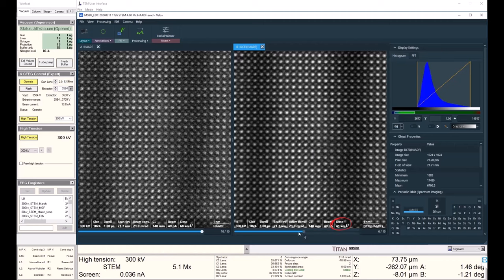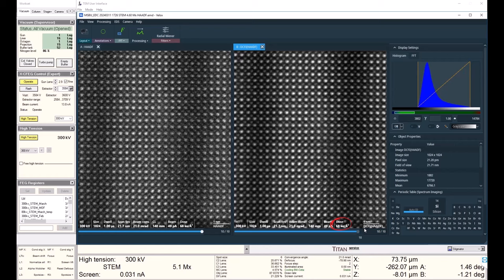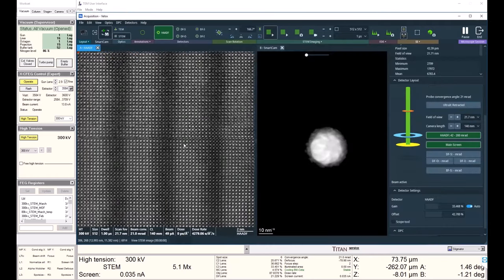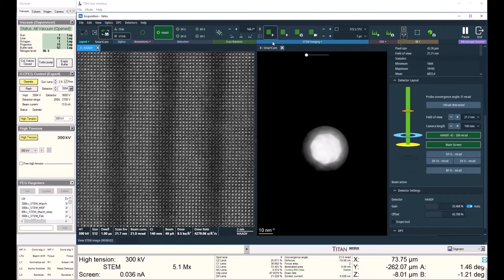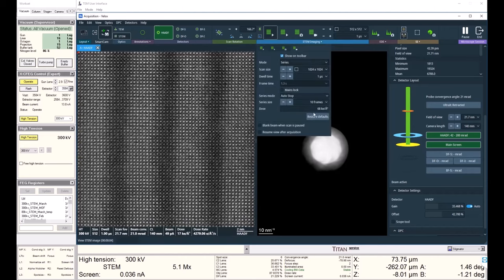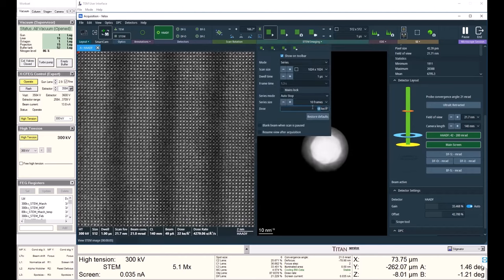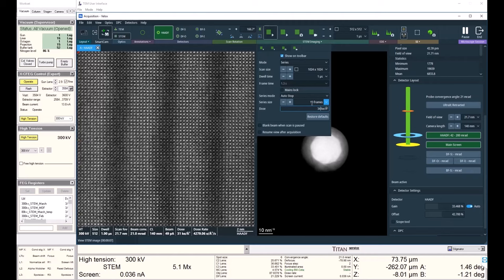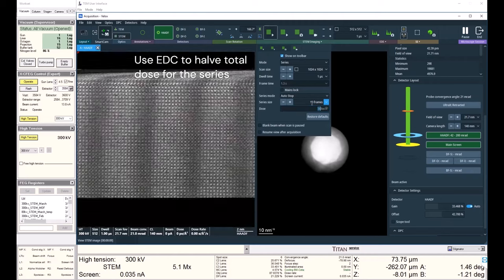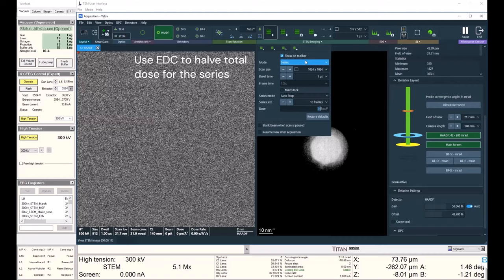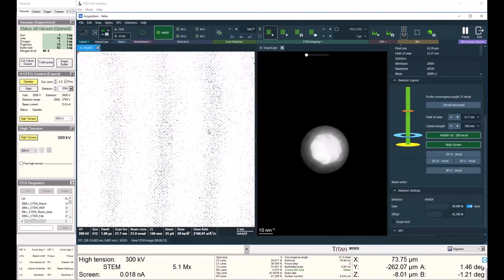I can also scroll through and see my dose change. So if I wanted to use a certain dose, I could sum fewer images or more images. And say I like this image, but I notice my sample is damaging. I might want to decrease the dose. So I could go to the total dose, set it to 34 kilo electrons per angstrom squared to halve it. This will change the gun lens setting and the corresponding dose and dose rate.